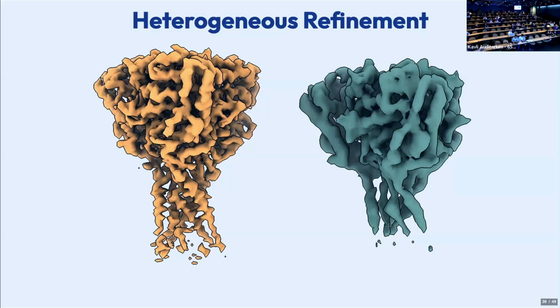So it's also recommended, as an aside, that for extra certainty you try running the same jobs multiple times. There's a parameter in CryoSPARC called the random seed, and by default it changes every time you run the job. So if you just clone a job and run it again, you can potentially get different results, and that's worth trying. Not to be sure, but more sure than just running the job once that you haven't missed something. So these are just some extra thoughts.